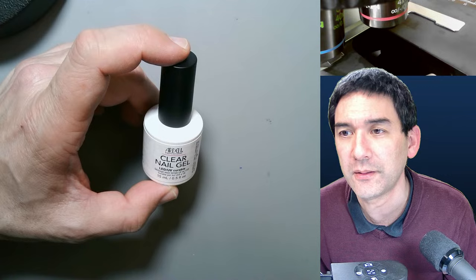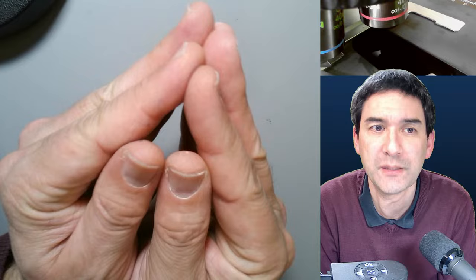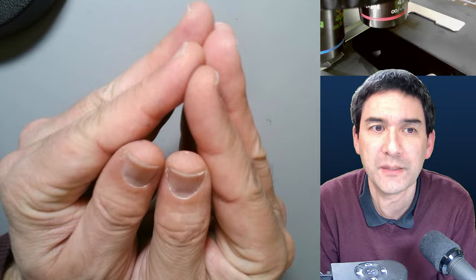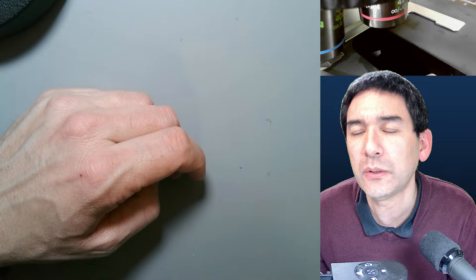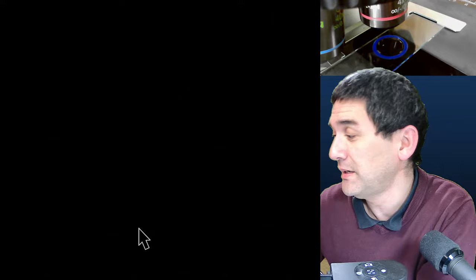You don't see any veins in the cross-section of the monkey tail — that's because veins have a very thin wall since they carry low blood pressure, and sometimes they collapse together so you cannot see them properly. Where might antique slides be collected? Especially in the UK and Great Britain, during the Victorian era in the 19th century, they made a lot of these slides. There are some people who collect them, and I also bought a few.